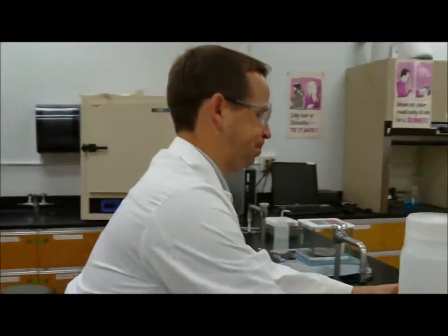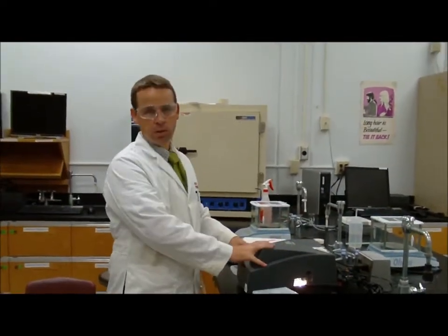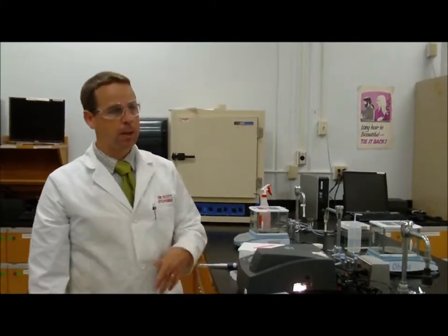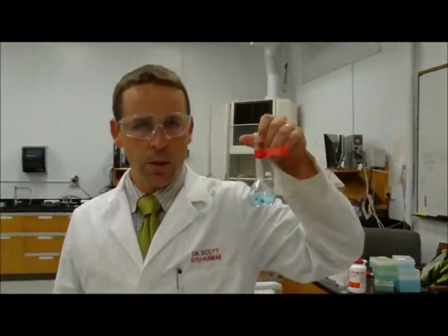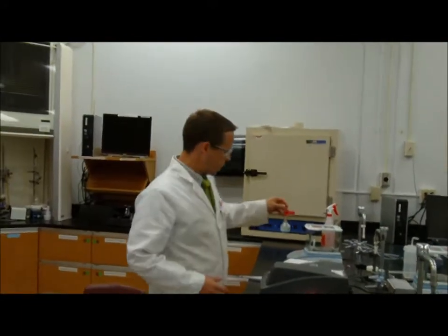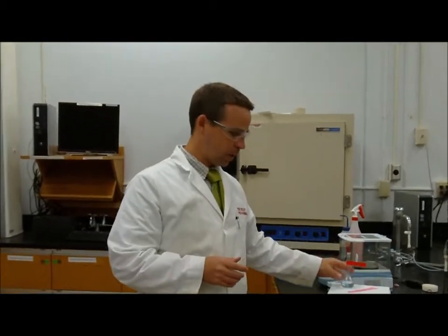All right, so today we're going to review how to use a spectrophotometer to determine the concentration of an unknown, okay? So I have an unknown concentration solution of copper sulfate here, but I don't know its concentration. So I'm going to try to determine the concentration of this copper sulfate unknown, all right?